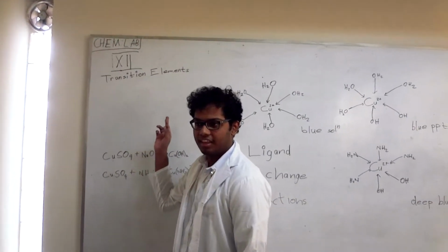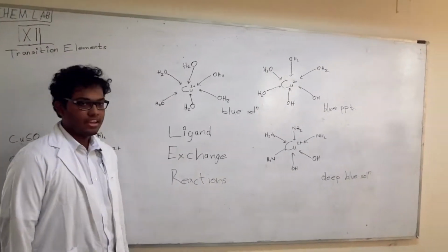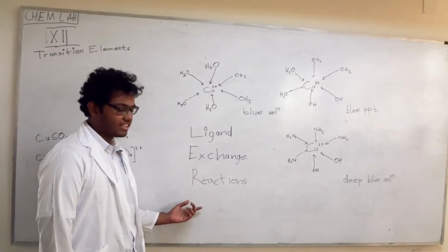Transition elements and their chemistry. So today at the lab we are going to study ligand exchange reactions.